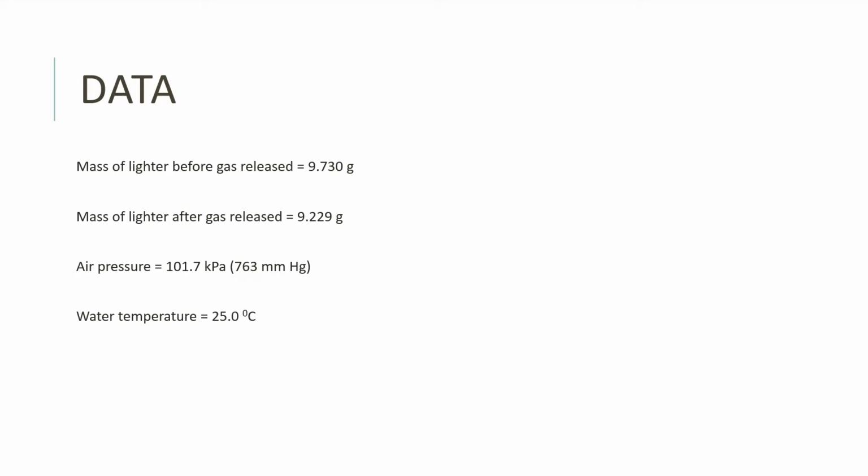Data. To calculate the molar mass of the butane gas, there are a few data points that must be recorded: the mass of the lighter before gas was released, the mass after gas is released, air pressure, water temperature, water vapor pressure, and lastly, the volume of gas collected.